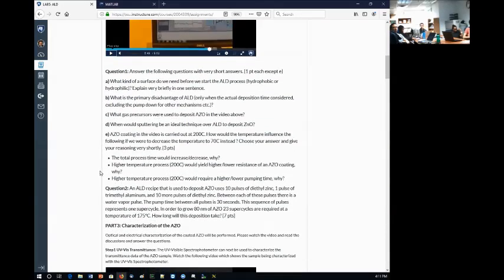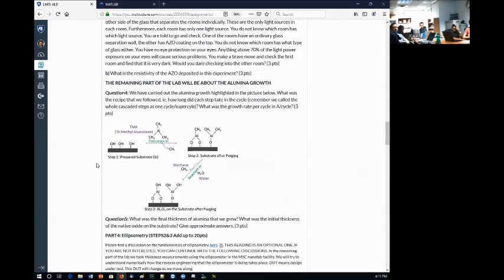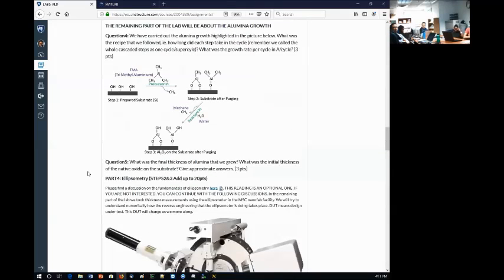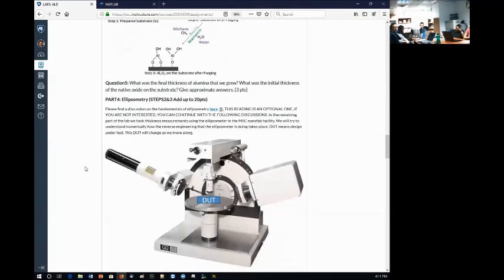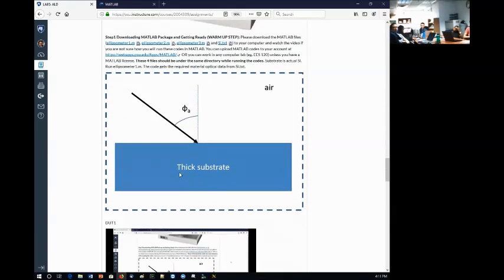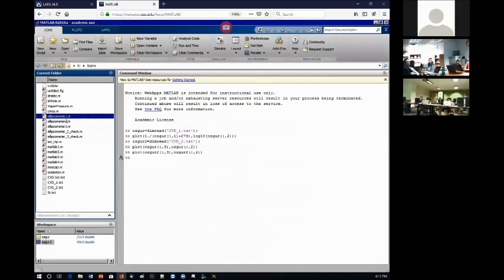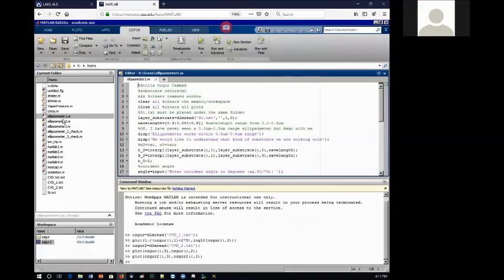Okay, now, let's say that we go to the lab, and we would like to get just one ordinary silicon wafer, but we would like to also understand what kind of a wafer we're looking at. Is it silicon or not? To understand that, we need to run ellipsometer1.m, okay? That's the first one we will run. Ellipsometer1.m. Double click on it.